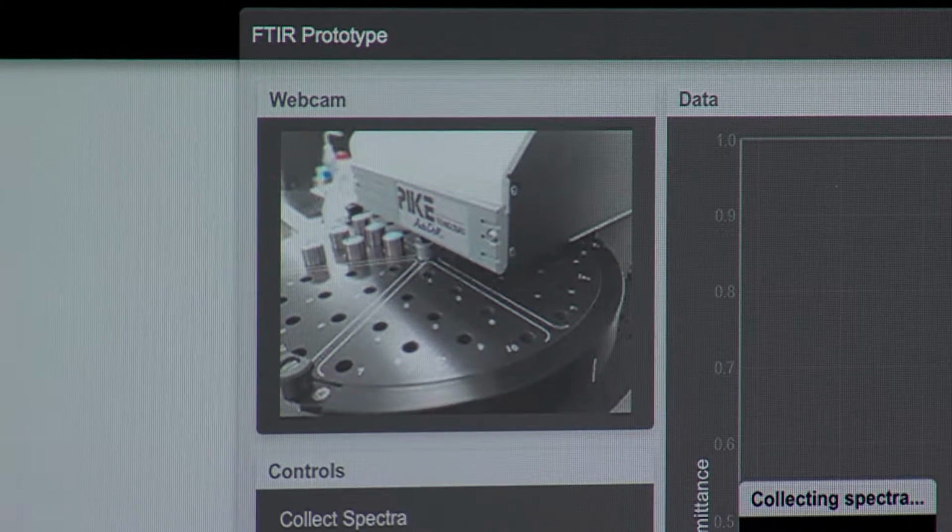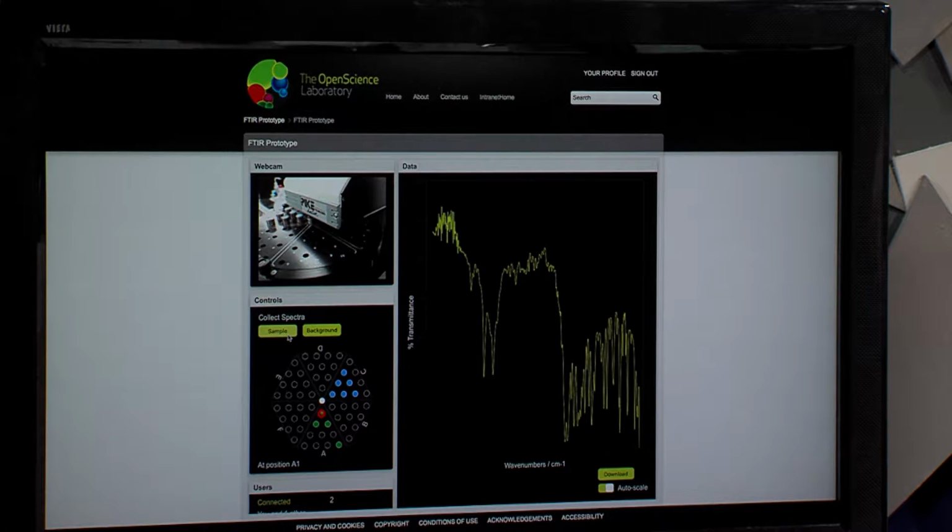We have quite a simple interface for this. Each time one of the circles goes around, it's collecting data. It collects data for 16 cycles, and we get these peaks here. Each of these peaks effectively is absorption of light by one of these bonds. So we can tell by the shape and the pattern of the peaks what's actually present, which atoms, which chemical it is. But also by the size of the peaks, we can tell the concentration, so how much is there.